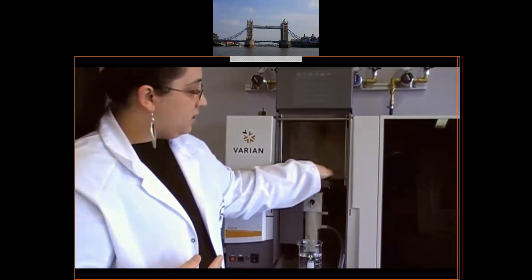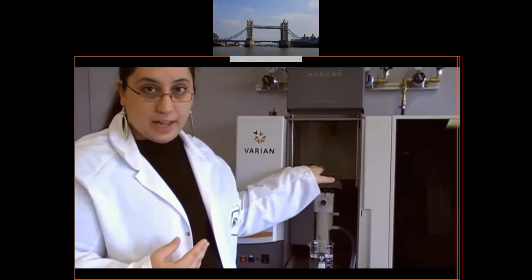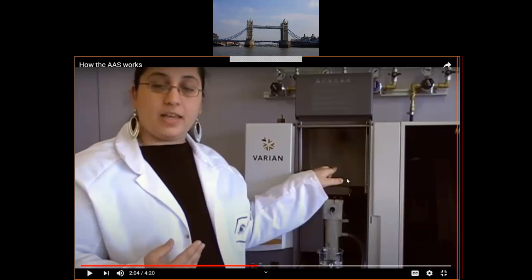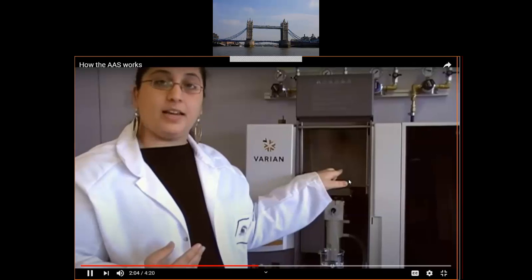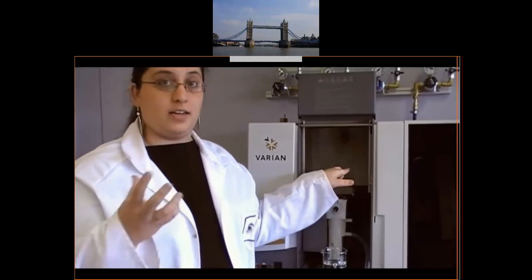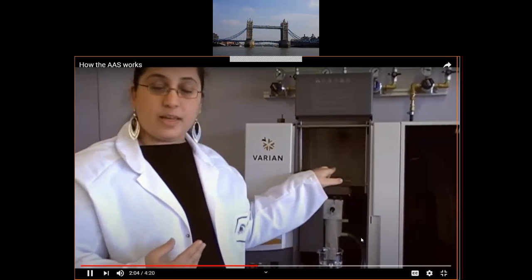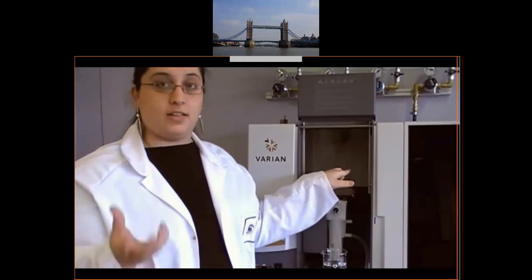At this point, a light is shone through the base of the flame. Okay, at this place that is pointed out there will be a flame, like a Bunsen burner or a gas stove, a blue flame. And this is where we can get excitation of electrons that are within the atom or ion that we're interested in looking at. And this light comes from a hollow cathode lamp.